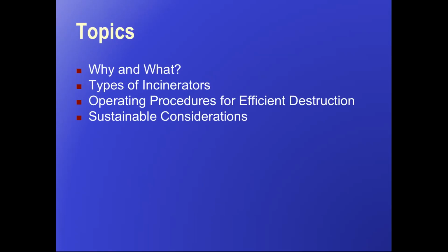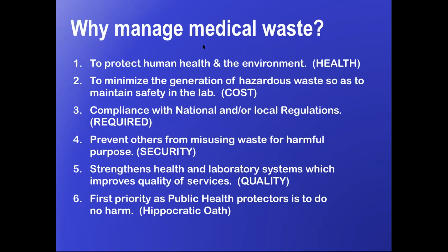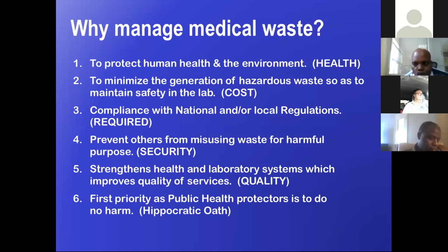So first of all, the question is why? Why are we managing medical waste? Well, there's the viral load initiative that's taking place, and simply you have to take care of it. But as public health professionals, there are several other reasons. First of all, it's not just to get rid of the waste, but to protect human health and the environment. It's to prevent mishaps in the laboratory that can result in cost. It's required in many countries. And there's security and quality, but I'd like to jump to slide number 6.